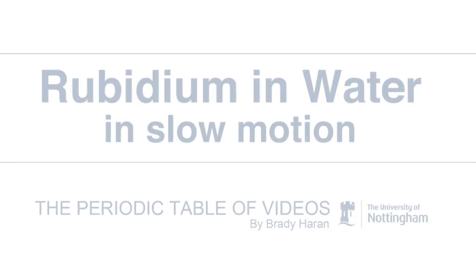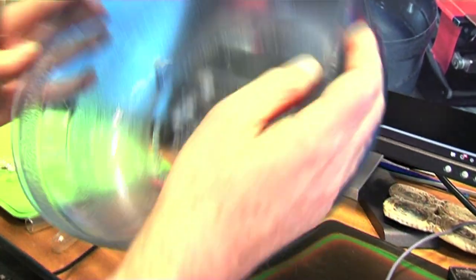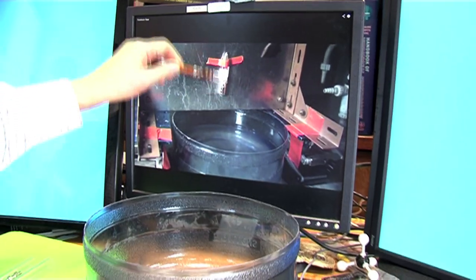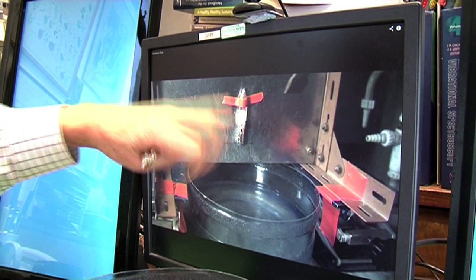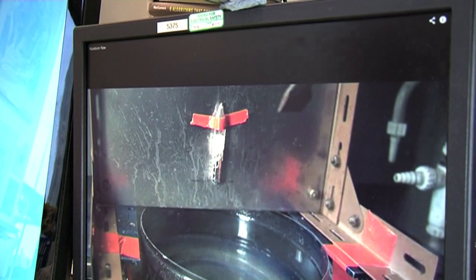So what we've got here — and it's almost life-size because this is the actual trough here, but with no water in it — we've got a trough of water and an ampoule with five grams of rubidium. It had almost melted by the time the experiment started, and the hammer is just coming down here.